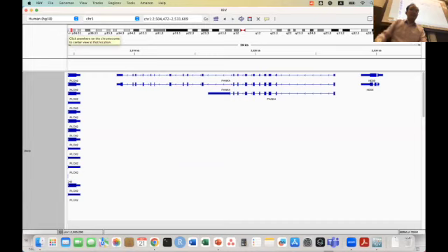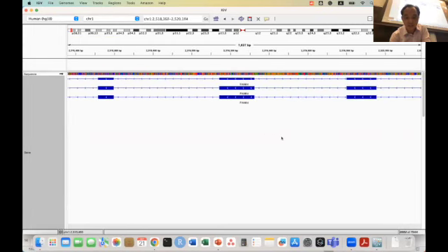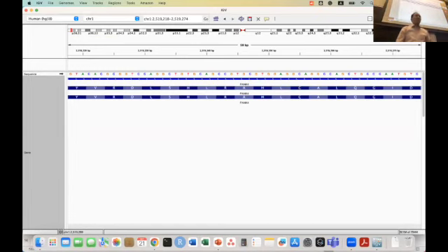So there are 99% waiting behind it, right? Now, can you guys magnify to see some exonic region? Just choose any exonic region of the PANK4 gene.